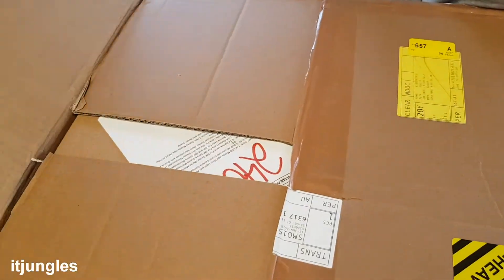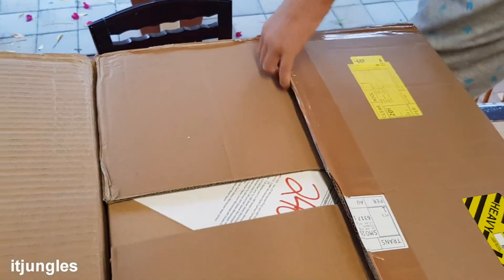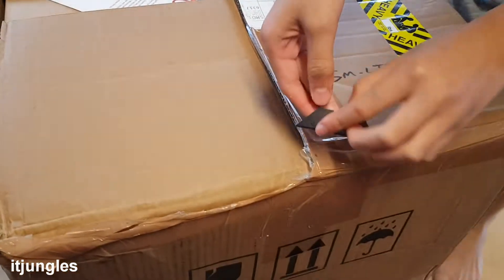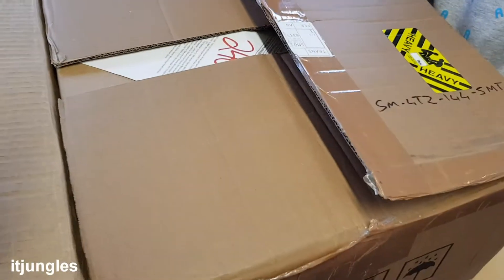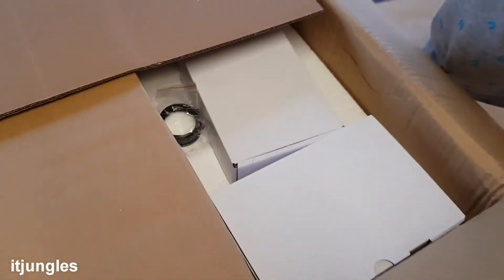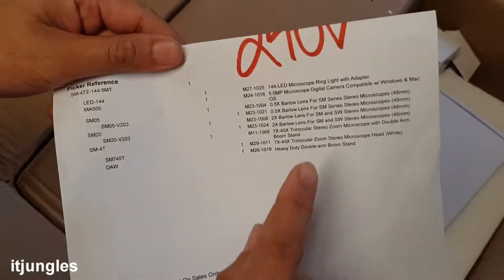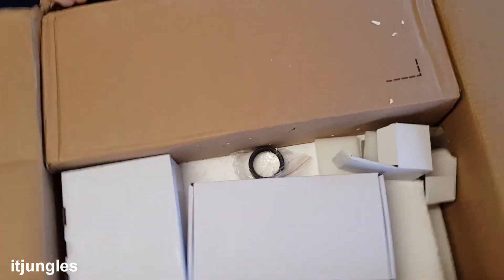Just need to cut up on this side as well. So once this is open, there is a packing slip over here, and this is what is inside. I've got the reference and I suppose these are all the parts that are going to come inside the box. I'm just going to pull the box to the side — it's quite heavy.